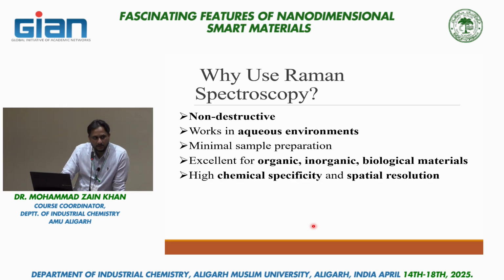What is the importance or the advantages of Raman? It is a non-destructive technique. The sample remains good. It can be used for aqueous environment, because most of the techniques cannot use aqueous media directly. If you have a sample in aqueous media, you have to extract it into an organic layer, then only you can use it. So the beauty is that it reduces the tedious protocol of extraction. You can directly use the samples in aqueous media.